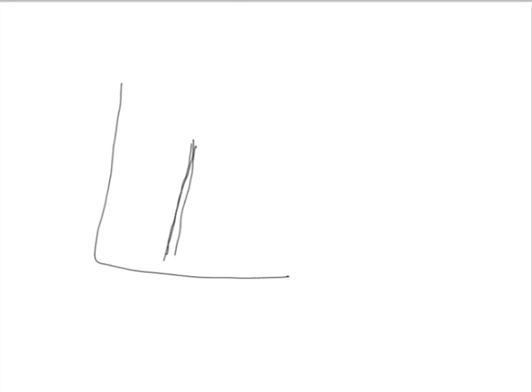So, what you get in real terms is a peak, which does not show these individual spectral lines, but there are closely spaced spectral lines in there. The absorbance, or optical density as we say, is what the readout gives; a spectrophotometer is in essence reading the absorbance at a particular wavelength. So, if you plot absorbance versus wavelength, then you will get these peaks at particular wavelengths, and that is lambda max.